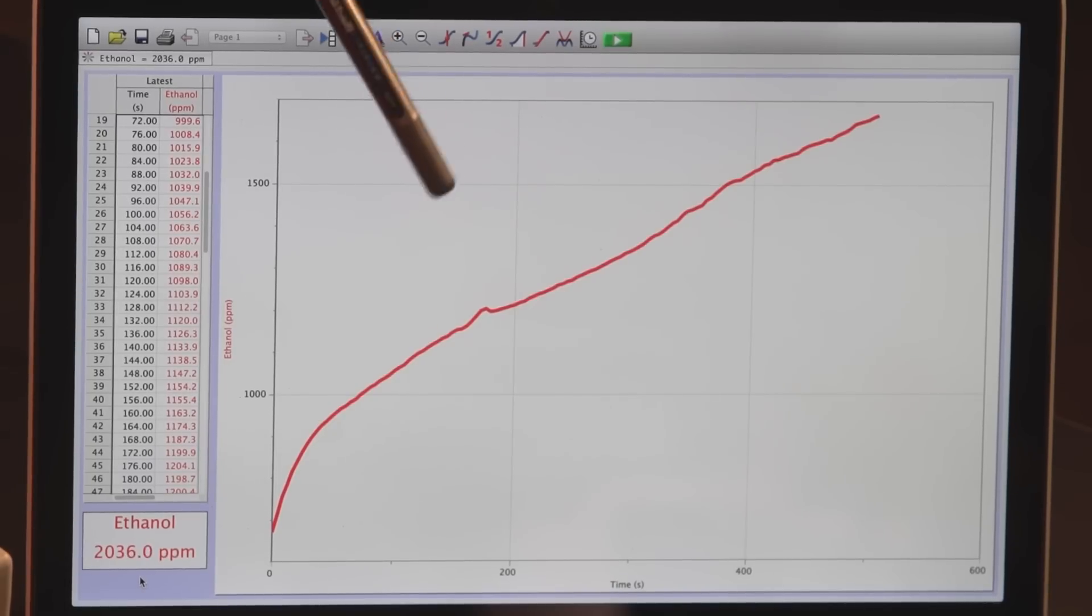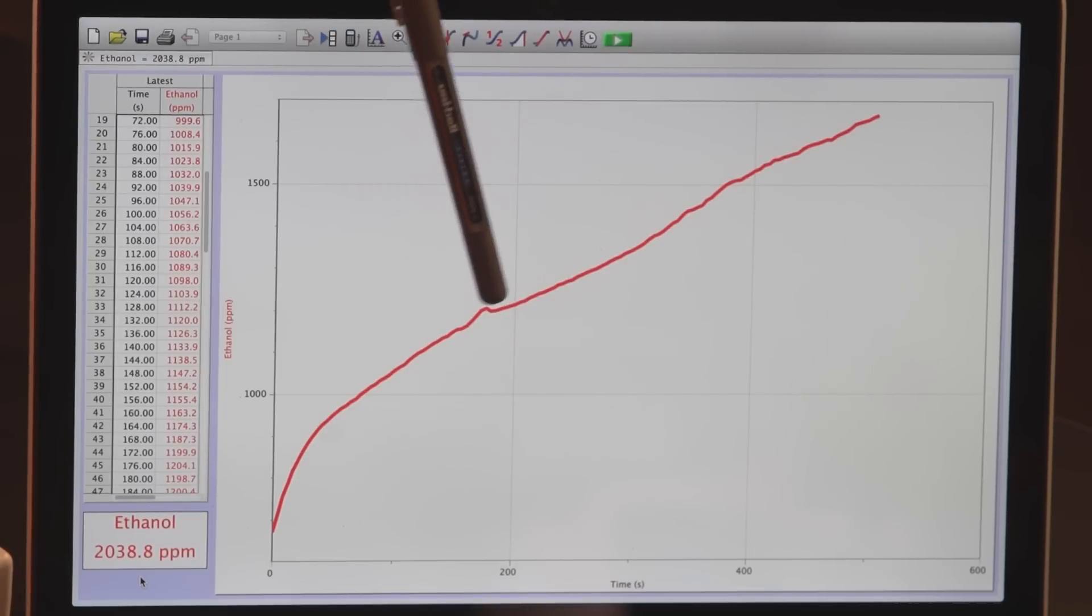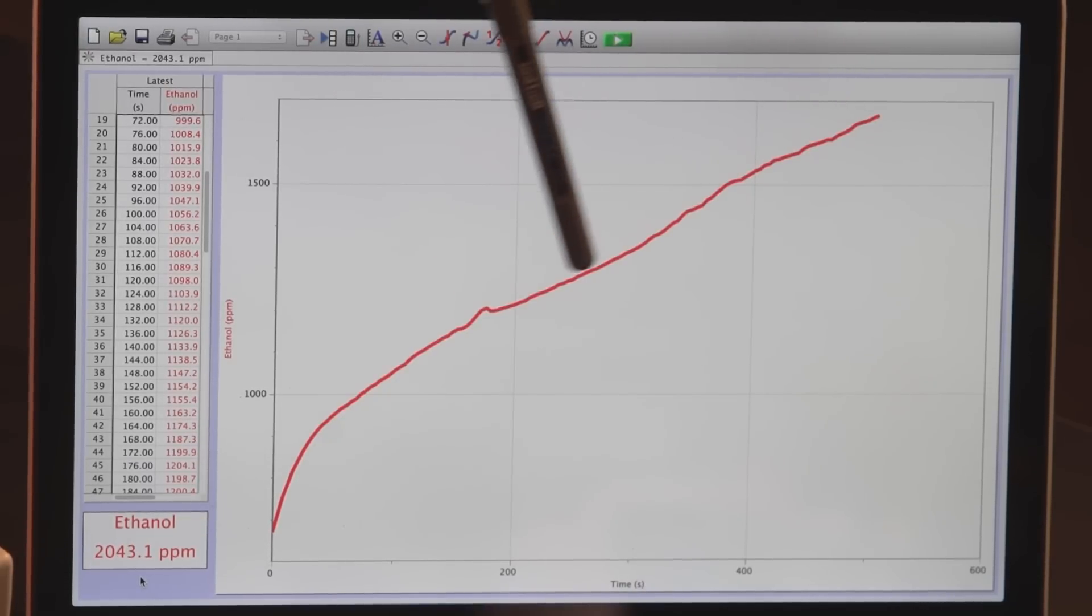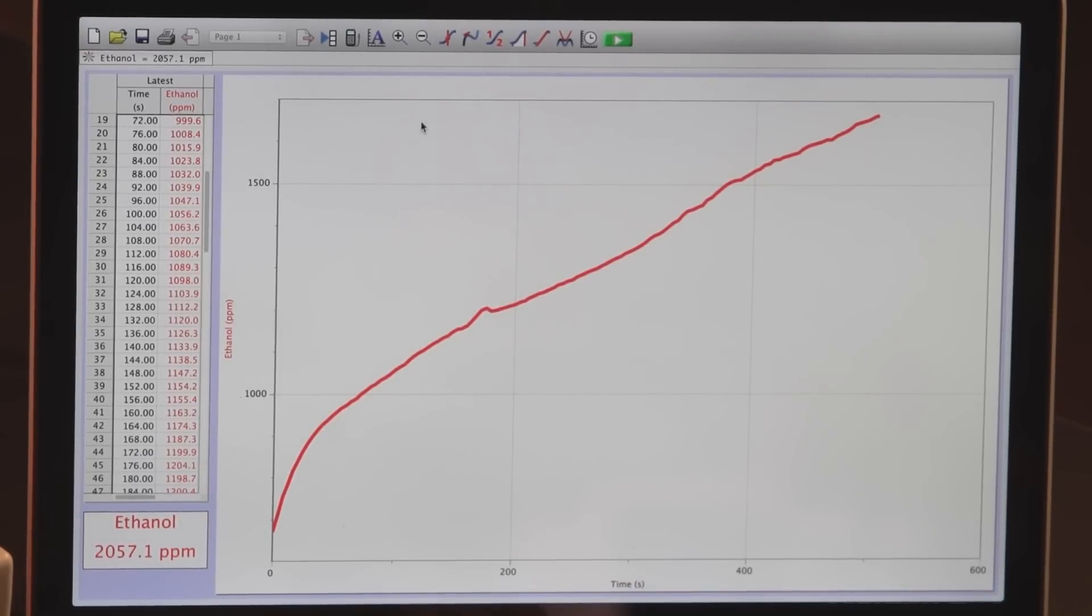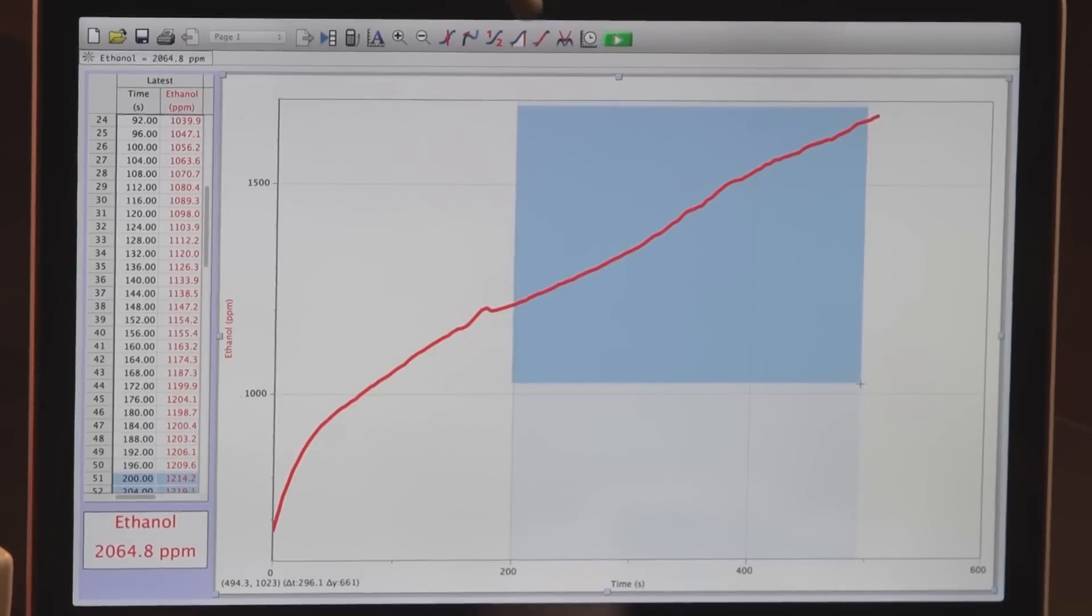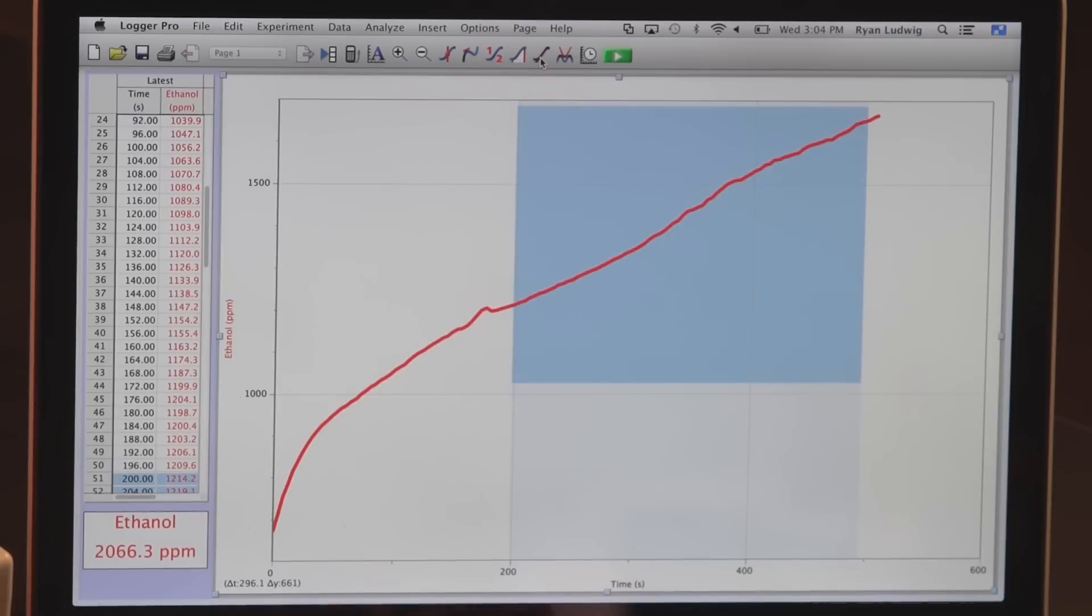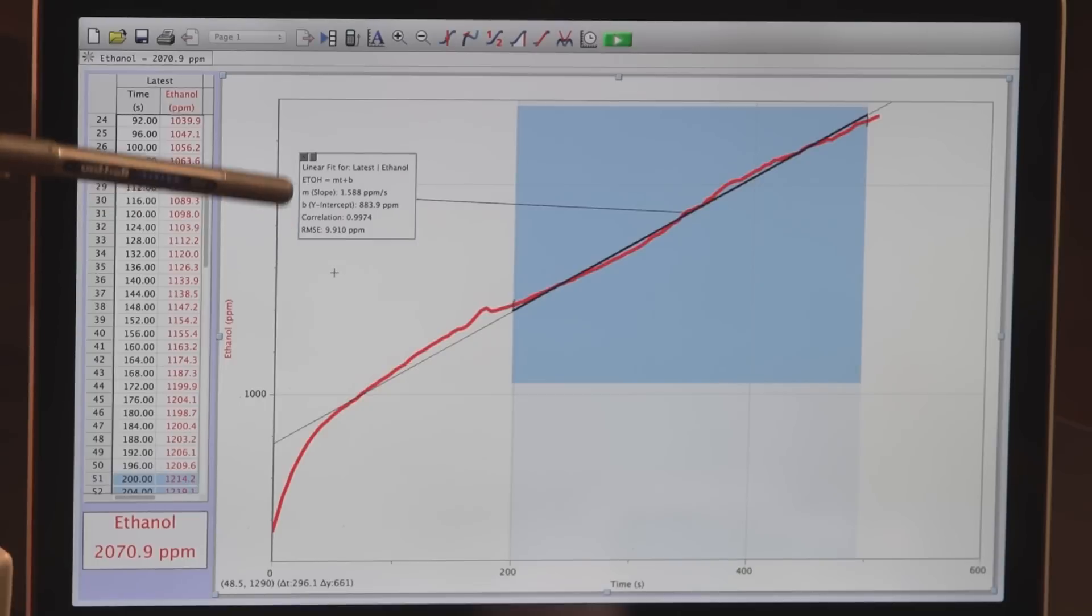What we're really interested in though is the rate that the ethanol production increases over time. So if you take a look at it right from about 150 seconds on, that's really what we're interested in—the rate of ethanol production. Not this little increase here but the increase on from about here. So what I'm actually going to do is select a region from around 200 seconds to the end here and perform a linear fit to actually get the fermentation rate of the yeast. So I'm going to tap on the very top here right at around 200 seconds, then I'm going to drag across. I've highlighted that whole region. Then I'm going to tap on this button right here, which is the linear fit button. And you can see right here in this little helper box that the slope is about 1.588 ppm per second. If I wanted to convert that to ppm per minute, I would just multiply that by 60.